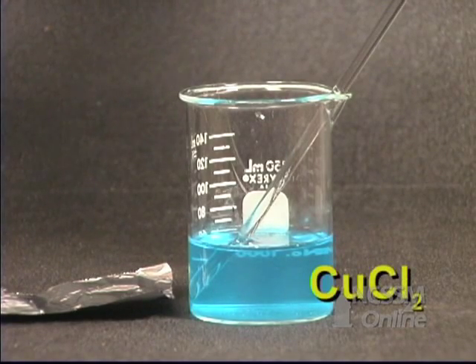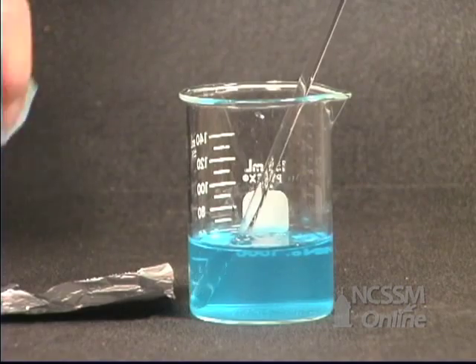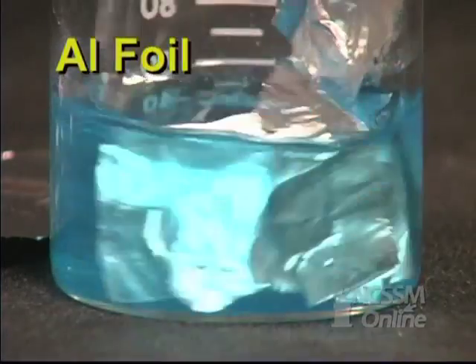We have a blue solution of copper chloride. We're going to add several pieces of aluminum foil to the solution. The solution is stirred.